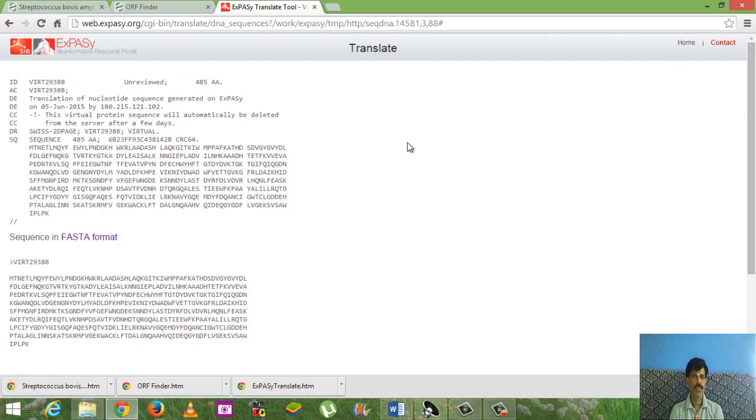Okay. With this we conclude the part on ORF Finder and the ExPASy translation tool.